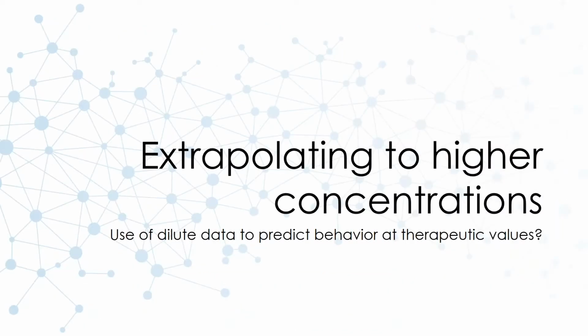Okay, so although the instrumentation is fully capable of measuring at the higher concentrations, if you're pressed for time or limited by the actual sample that you have and you don't want to do these measurements, we were interested in seeing if there's some way to use the information we get from the dilute data to predict the behavior at these higher concentrations or the therapeutic concentration levels.